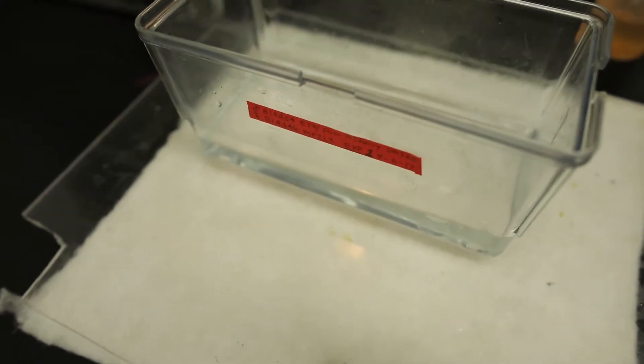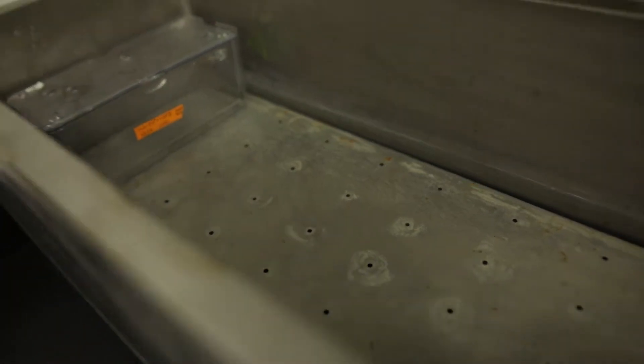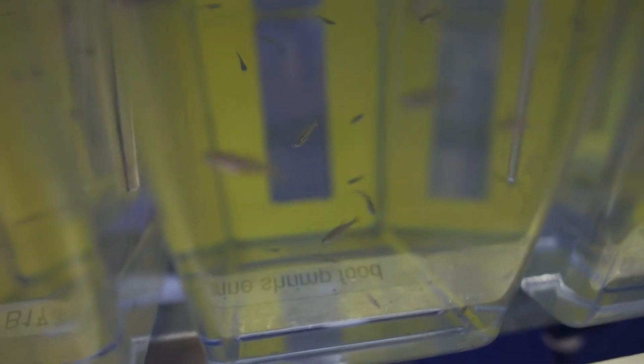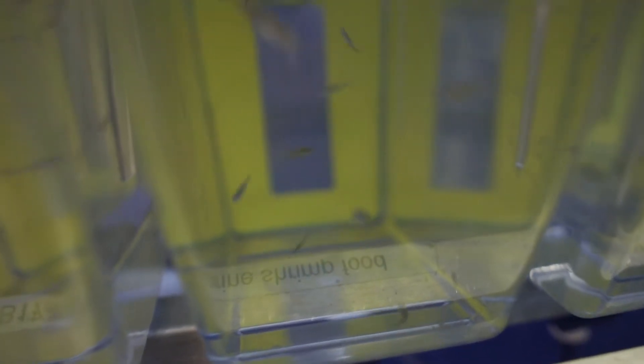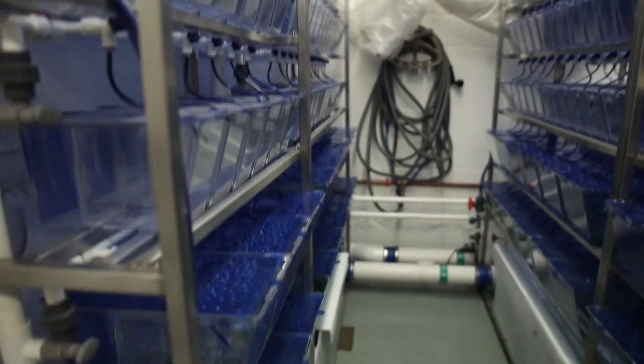Our larval culture protocol consists of keeping the embryos in a petri dish for one week. Then they are moved to a breeding tank in embryo media and kept for two weeks in an incubator, fed with larval AP 100–150 microns. After this, the embryos are moved to the recirculating system with baby baffles for three months. Each batch of fish that we raise gets a UN number.